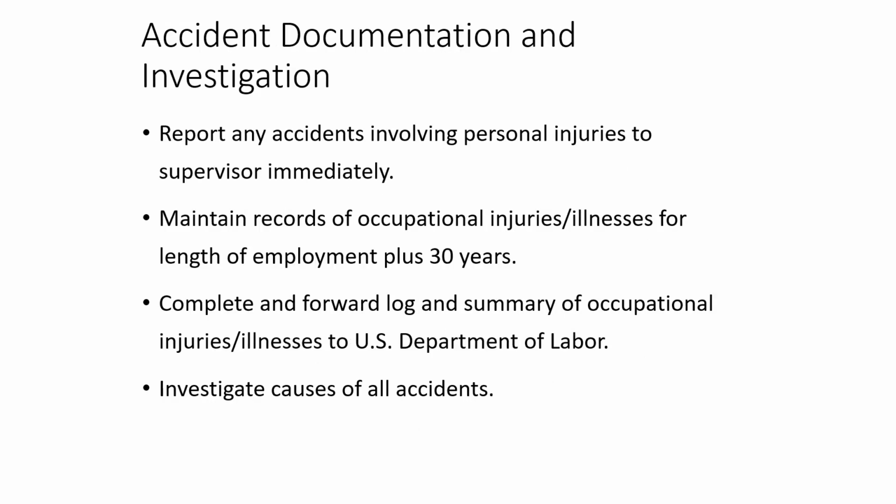Accident documentation and investigation. Report any accidents involving personal injuries to the supervisor immediately, and then maintain records of occupational injuries or illnesses for the length of the employment plus 30 years. Complete and forward the log and summary of occupational injuries and illnesses to the U.S. Department of Labor, and investigate causes of all accidents.